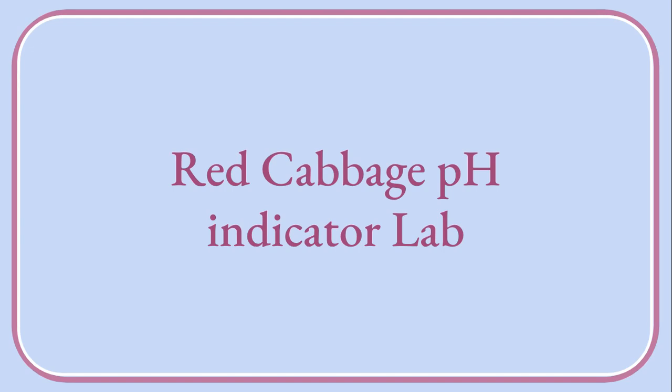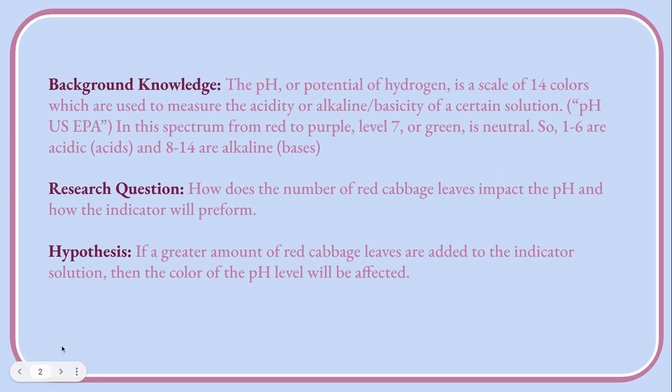Hi, I'm Jacqueline, and this is my red cabbage pH indicator lab report and documentation of the actual lab. So, first, some background knowledge.